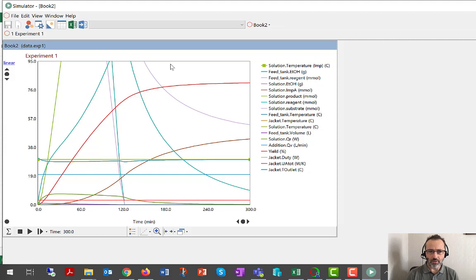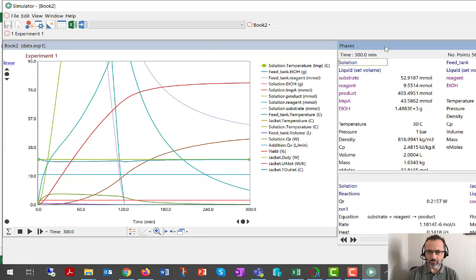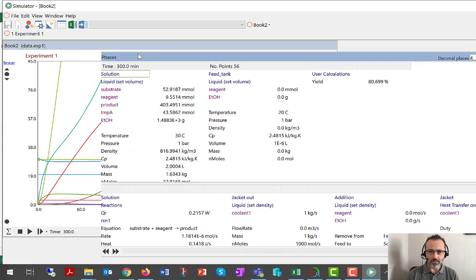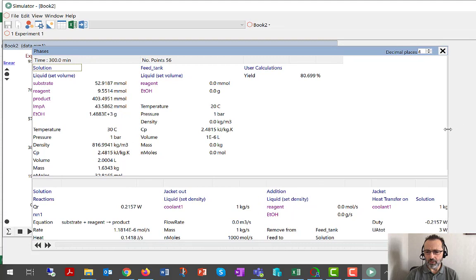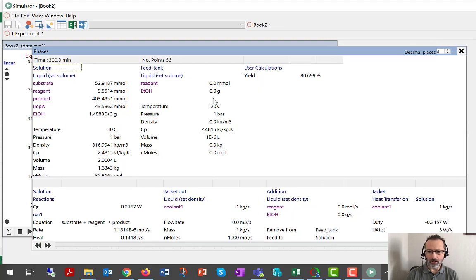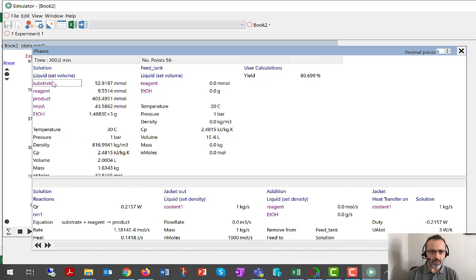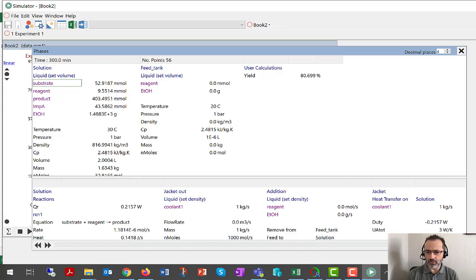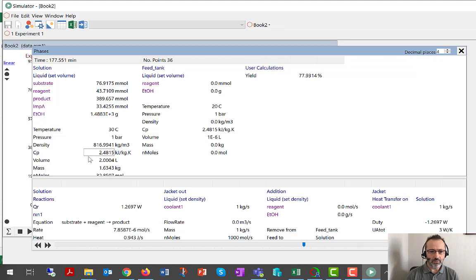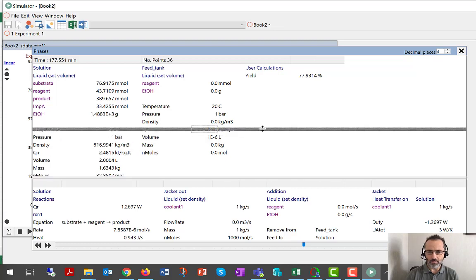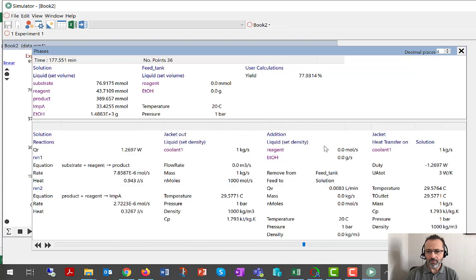Now, I just want to examine this model in the list phases dialogue, which we've done a few times before. This is the dialogue that gives a numerical readout of all of the values that are being tracked and used by the model. And we can see here the solution phase, all the components are listed. This is at a particular moment, 300 minutes, we can scroll back to other times if we want to know what was happening at another time. And you'll notice here the CPs for the solution phase and the feed tank phase are defined as we expect. And similarly, the CP of the jacket fluid is defined as we expect.